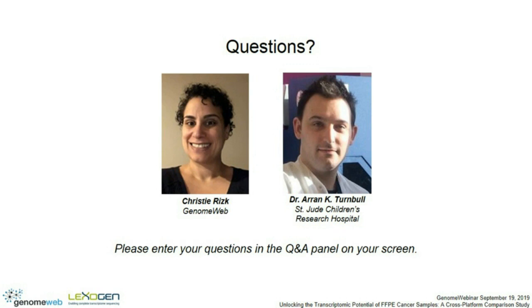What we have not looked at is the contribution of specific platforms to that, simply because we don't really have the data. As I said, this is not a comprehensive analysis. It wasn't intended to be that. We don't have enough samples, enough of the same samples on the same platforms to do that kind of analysis. And for some of the technologies, such as BioSpyder, Seq, at the moment we have only processed a very small cohort of patients on those platforms. So we're not really able to draw too many conclusions yet.